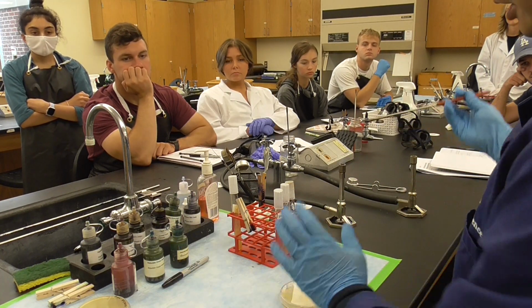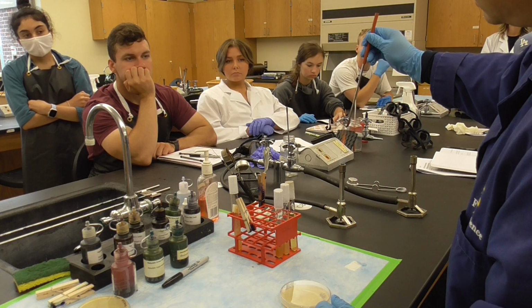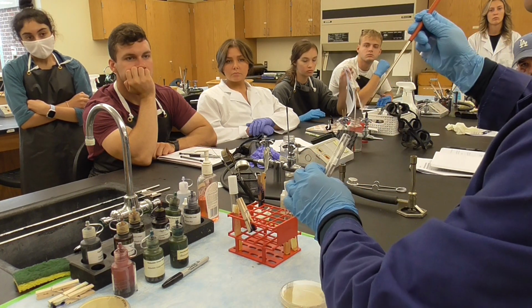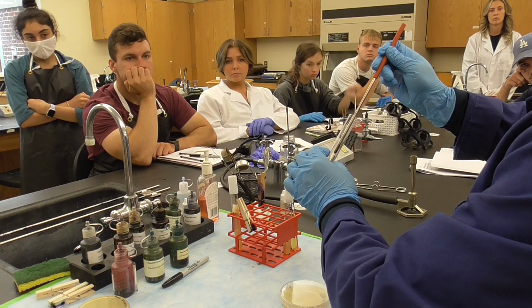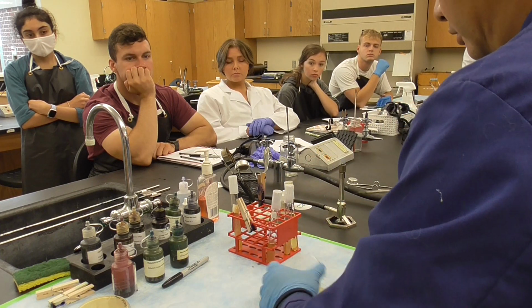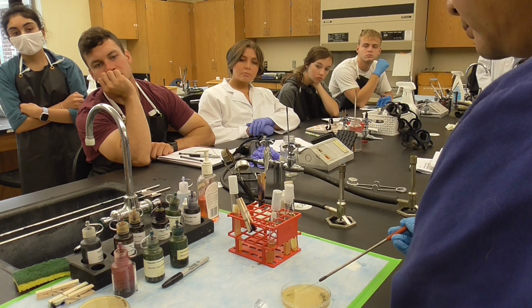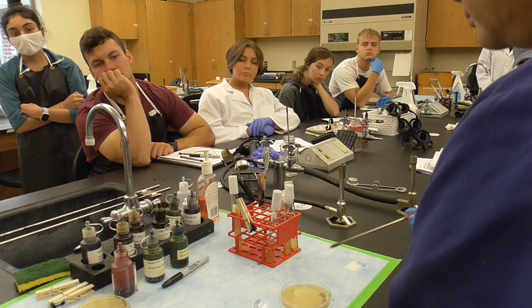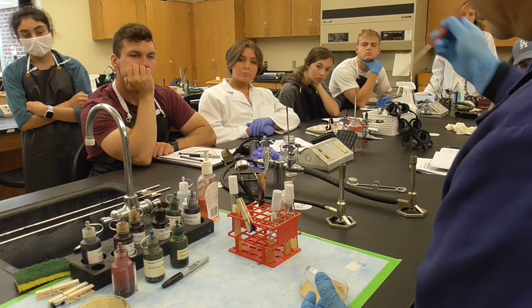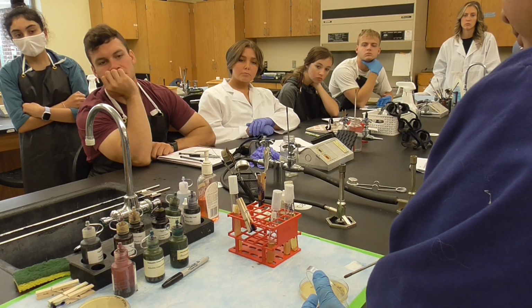Have your hands on the agar, okay? So make sure it's straight. You go ahead, flame it, cool down, and touch the bacteria. Okay, so go here. So first the streak is like this. Flame the loop. Cool down. From the side of the first streak to a second streak.